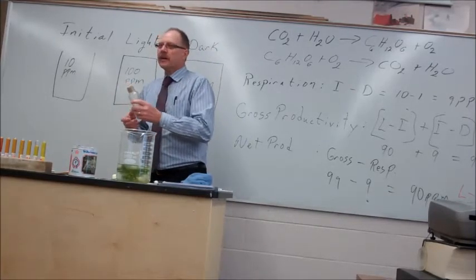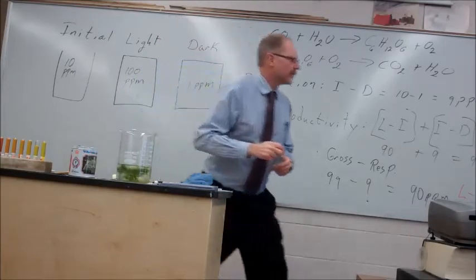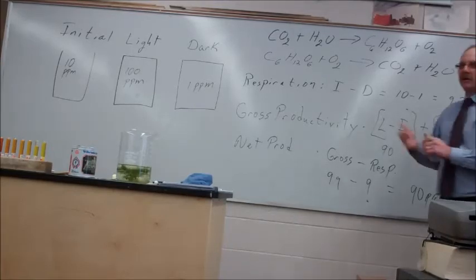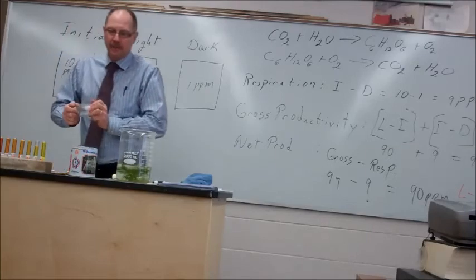And then 24 hours later, we just stick our probe in there. I hope that probe fits in these. Probe. Perfect. You've been probed. And we will get our numbers. All right? It's as simple as that. Doing the lab is very, very simple.